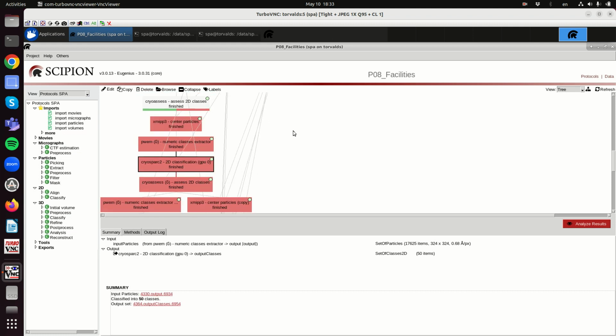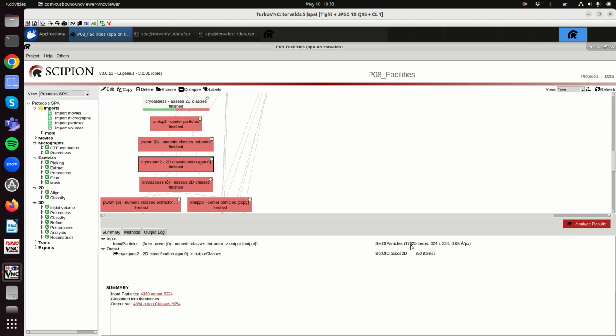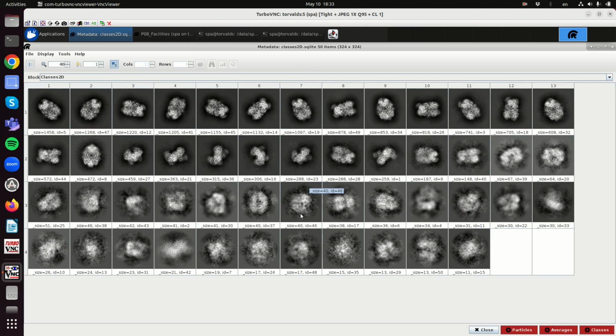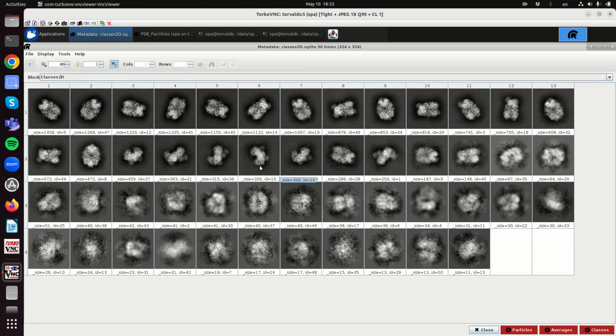So now half of them go to these populated classes, and again, as always, most of the particles are good. So these particles here have escaped picking, the deep consensus, and the 2D classification. So these particles were put into good classes before, and then they have also escaped the MIC-assess.